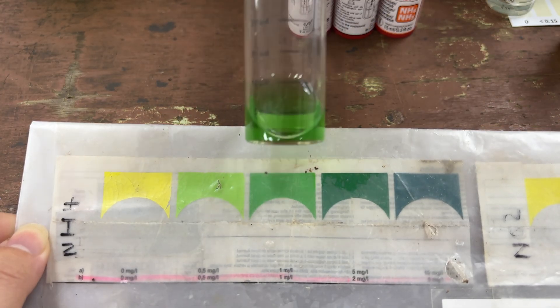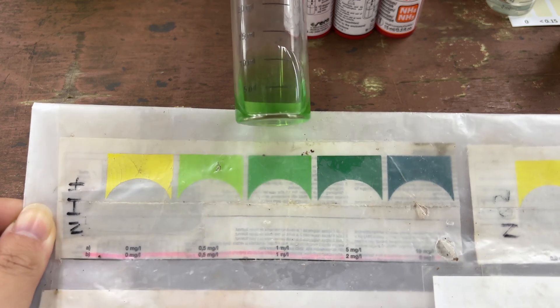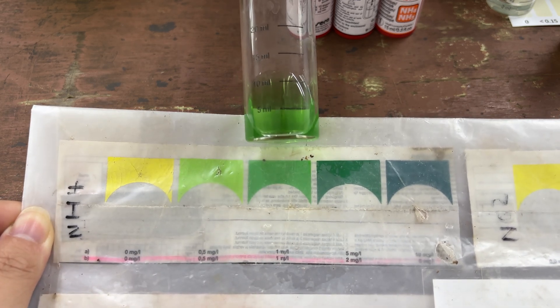Let's check out the results. The correct ammonia reading for this water should be 1 mg/L.